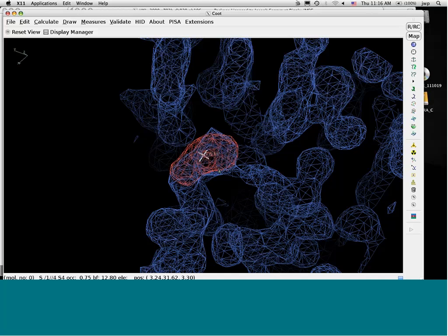I guess. Yeah, you know, one of the things you can do with difficult data to process is if you post to the CCP4 newsgroup, for example, a lot of people will jump in and help you. Certainly at Rigaku, people can send us their images and we will look at them. It's better if you're a customer of Rigaku and certainly using our equipment, but I know that we look at many beamline images for people. Life is too short to not bring in an expert when you're struggling.